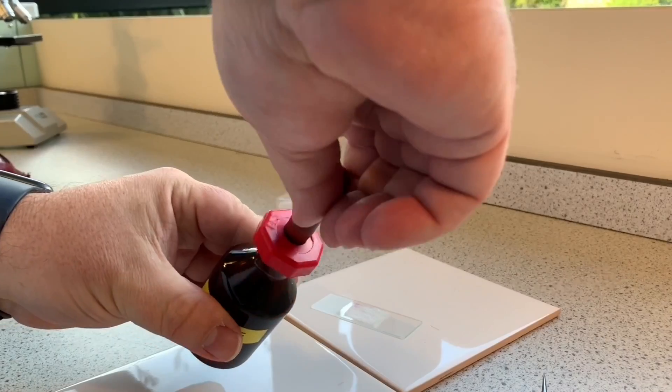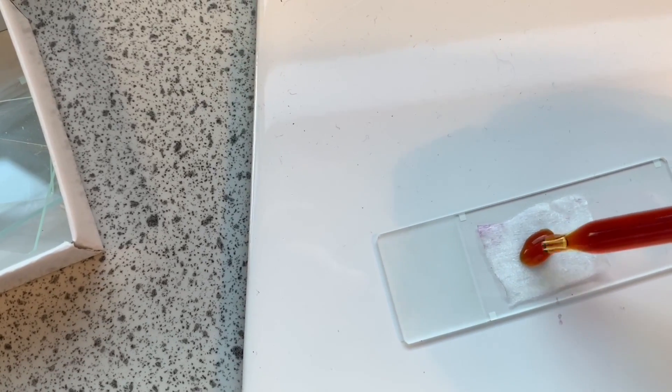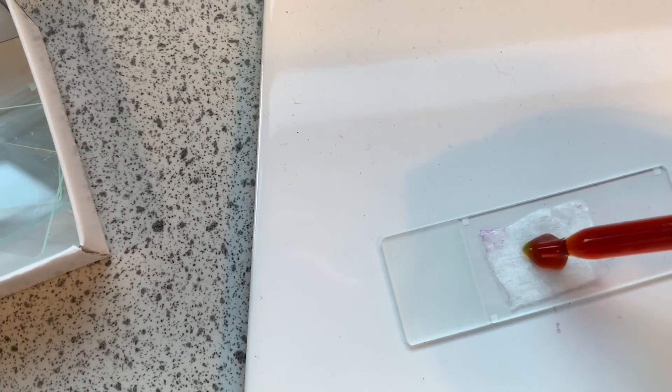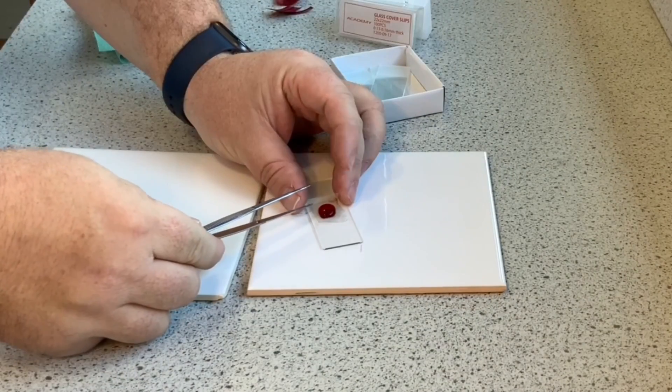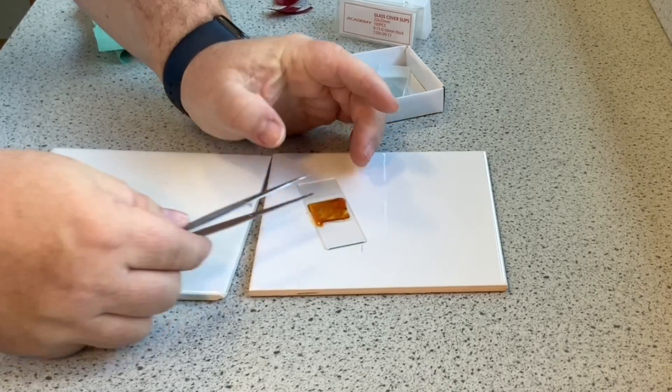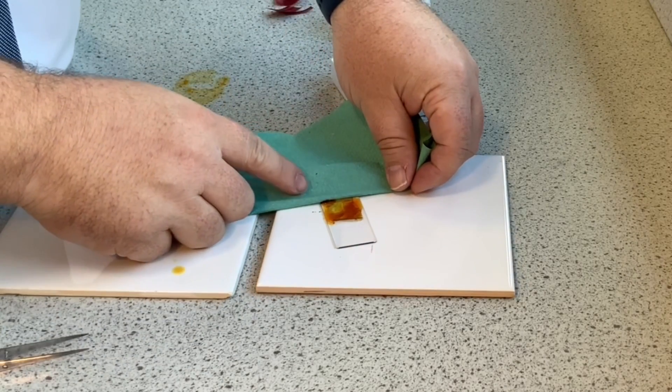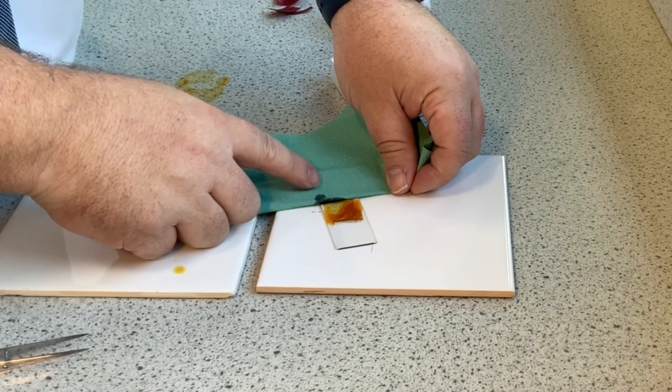The next stage involves staining your specimen. I'm using iodine here. Normally you'd put a drop of water on and then some iodine to really bring out the organelles in the cell. Gently place the cover slip at a 45 degree angle and slowly layer it onto your onion cells. Then gently place a piece of paper towel on the edge of the cover slip to drain out any surplus stain.